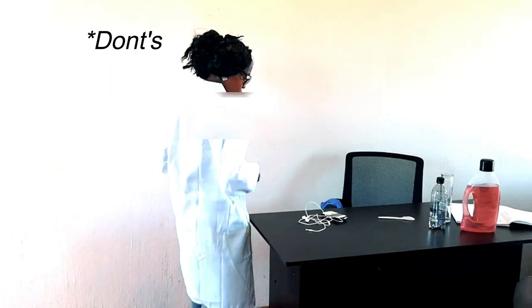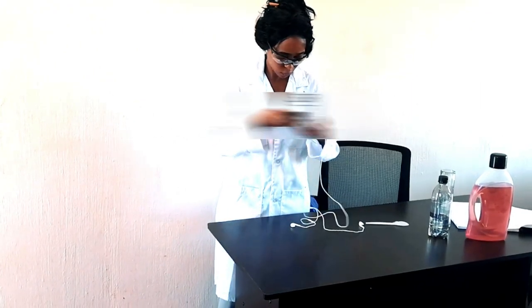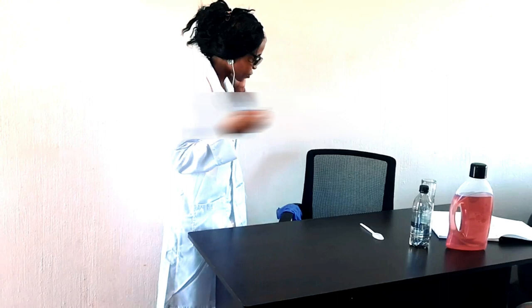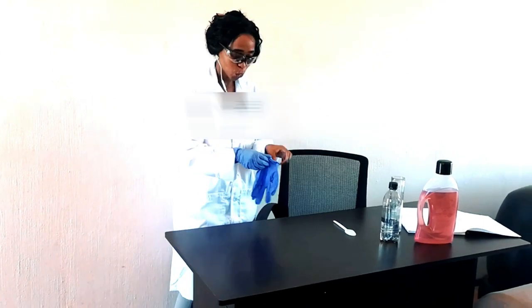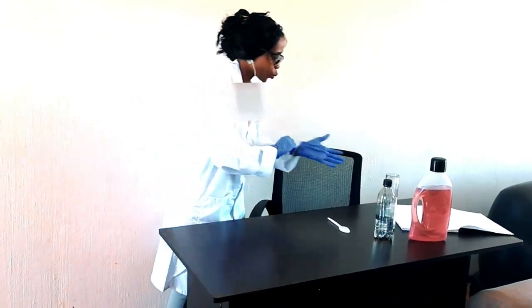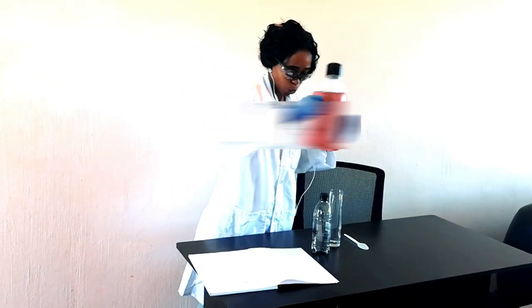Another mistake that people do is actually doing their lab work while they're listening to music. And they're listening to music with their headphones. So obviously when you're listening to music with your headphones, you're not aware of what's going on around you, because you're playing this music so loud and you're just enjoying it. And this poses a huge danger in such a way that if anything were to happen in the lab or in the building, you will not be aware, because you're just listening to your music and you're in your own zone.